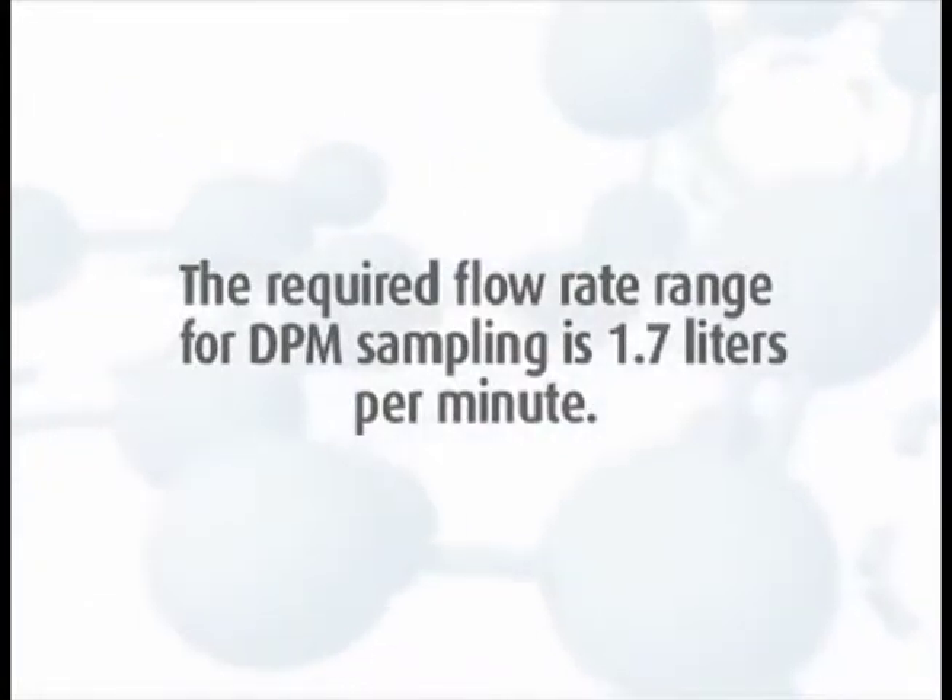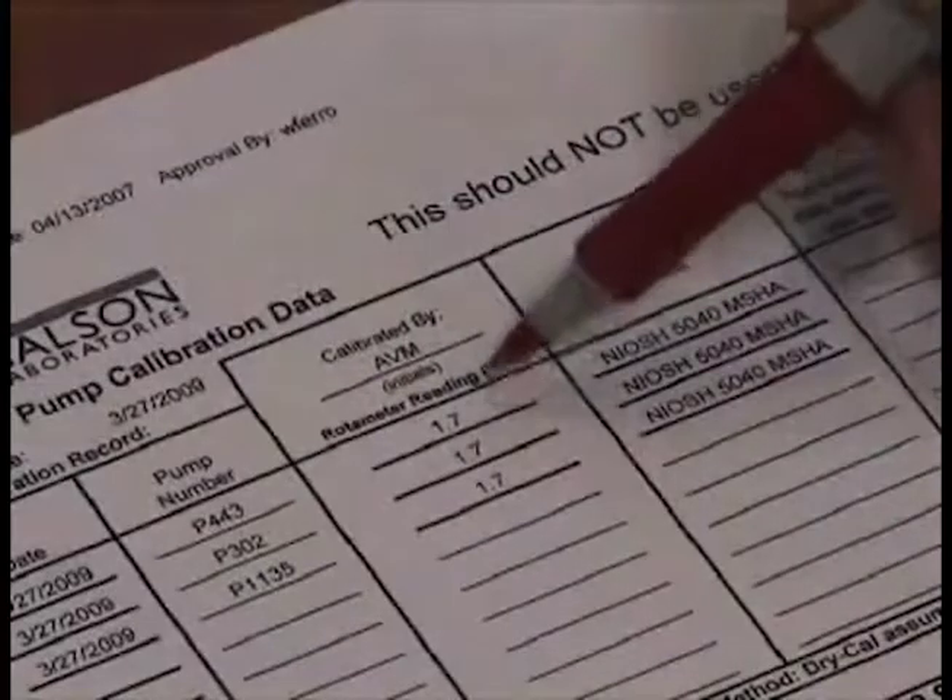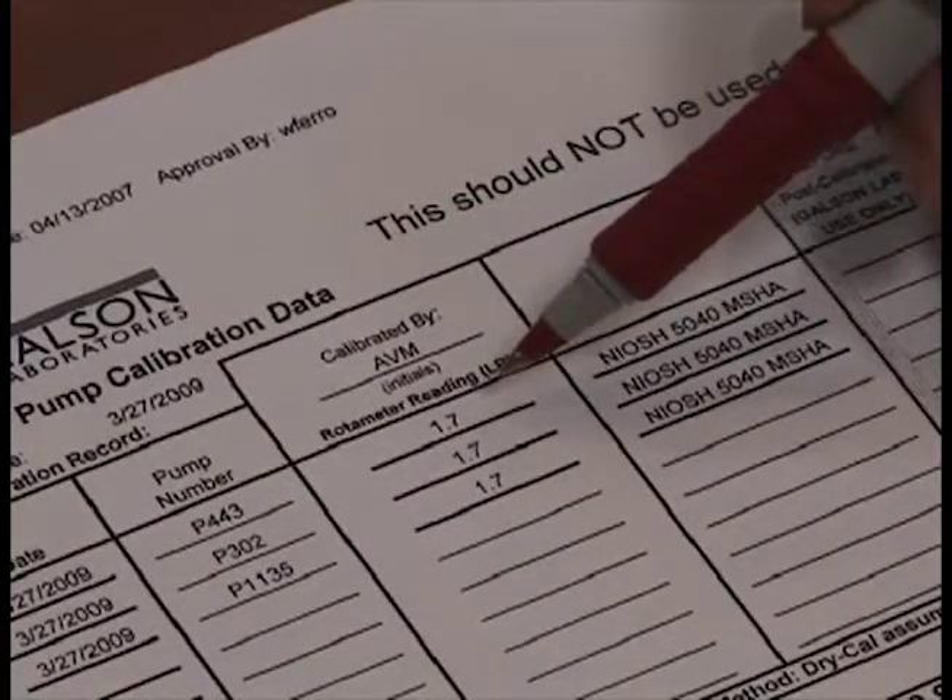The required flow rate range for DPM sampling is 1.7 liters per minute. Verify the recorded flow rate on the pump calibration sheet.